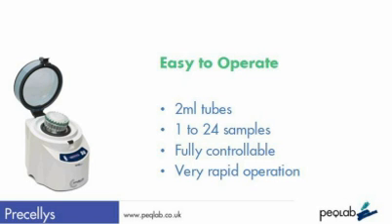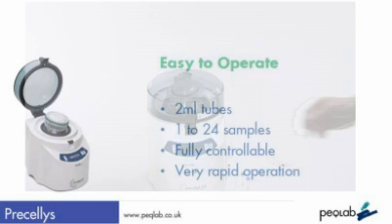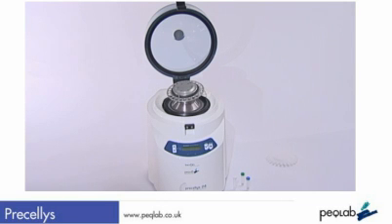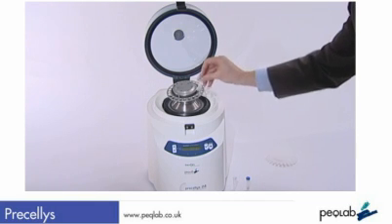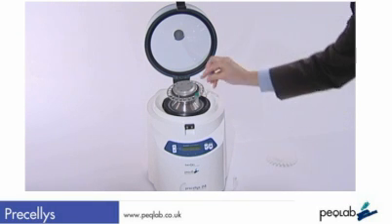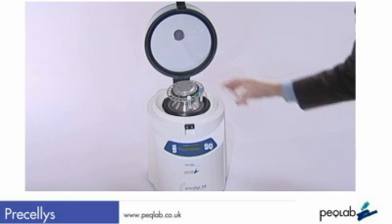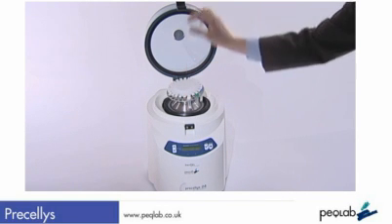It works with 2 ml tubes, taking up to 24 tubes in each run. It's very easy to load and use, so let's have a look at it. Here's the Pracillis 24 — a benchtop-sized piece of equipment with a clear lid. It takes up to 24 tubes, but you can put in just 1 or up to 24, and they don't need to be balanced.